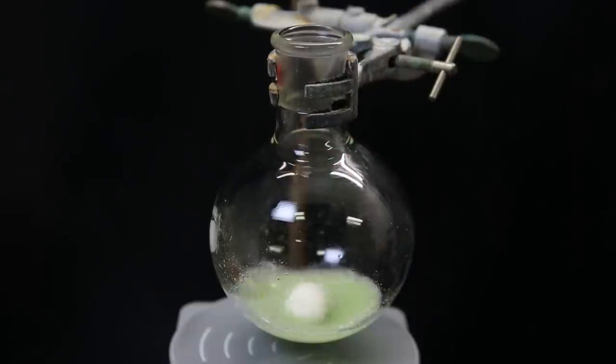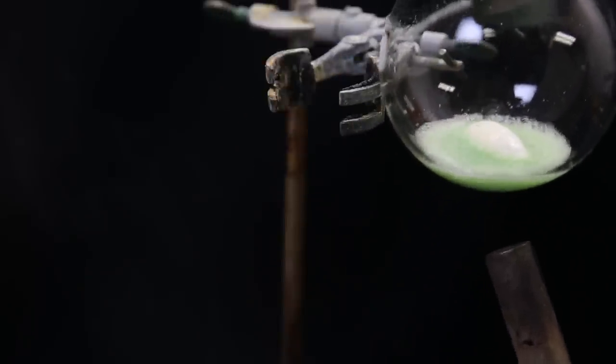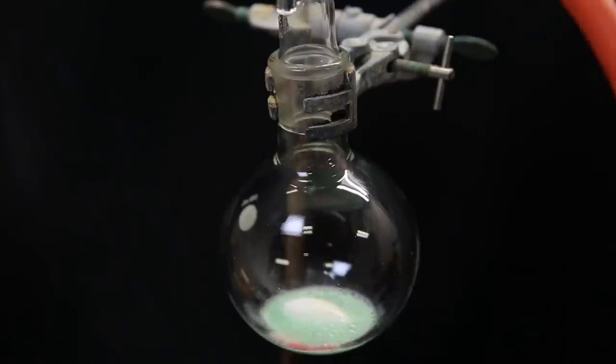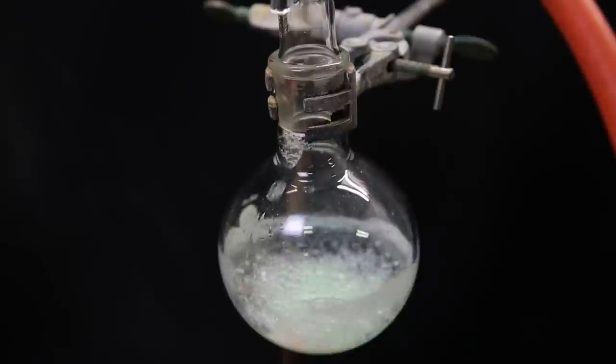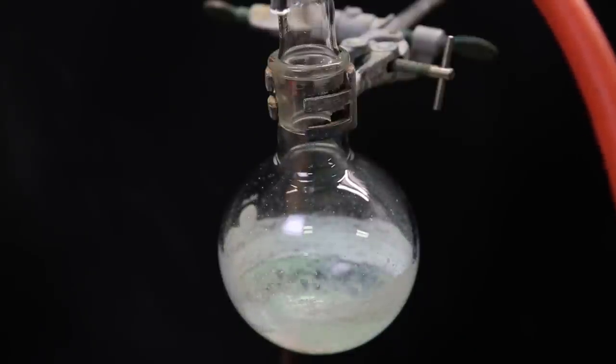Now I stir it for a bit to get it mixed and then heat it with a heat gun to get everything to dissolve and allow the nickel to ligate with the ligand. I then pull a vacuum on the flask and pull out all of the solvent, which leaves behind a light green coating of the ligated nickel complex.